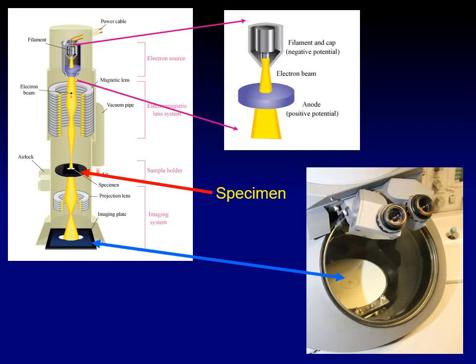What we tend to see here is a negative image or a deflection of the image of the virus particle. And usually this is in black and white. So there is no color, there is no immunofluorescence, nothing can be seen here except for a negative image of what is being captured through the deflection of the electrons from the surface of the specimen.